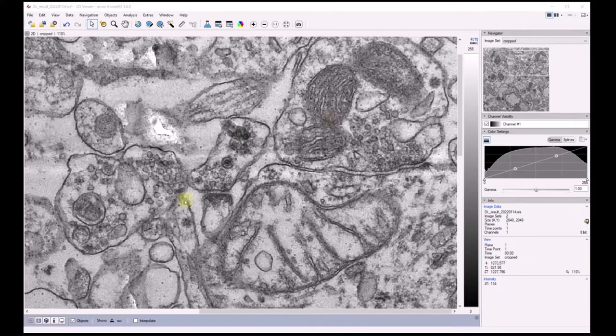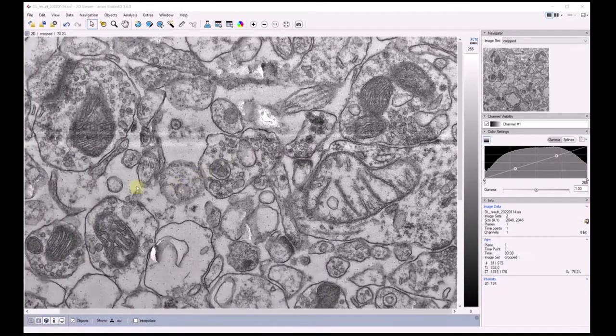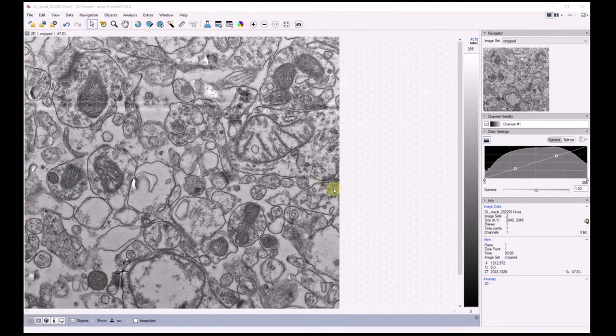By looking at the images, we can see that there are a lot of other objects which have similar intensities to the mitochondria, and that mitochondria themselves have very complex and different morphologies. In addition, there are also sample preparation artifacts, and there could be differences in the background intensity staining, which altogether makes it a complex and challenging project for image analysis.